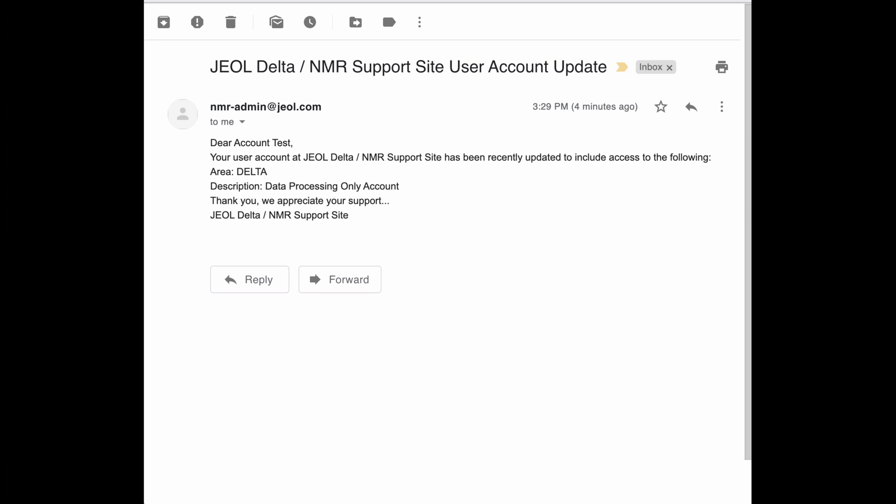Once you have been approved, you'll be able to go back into nmrsupport.jeol.com and download copies of Delta or generate license keys.